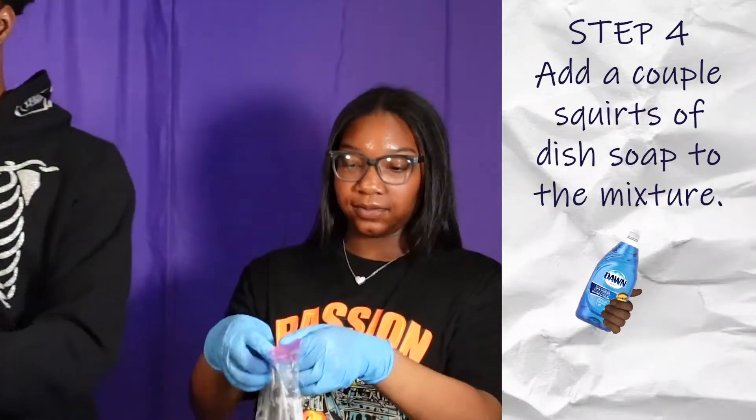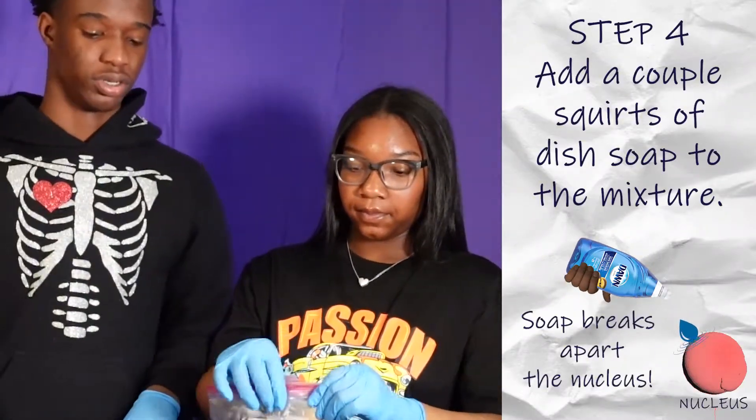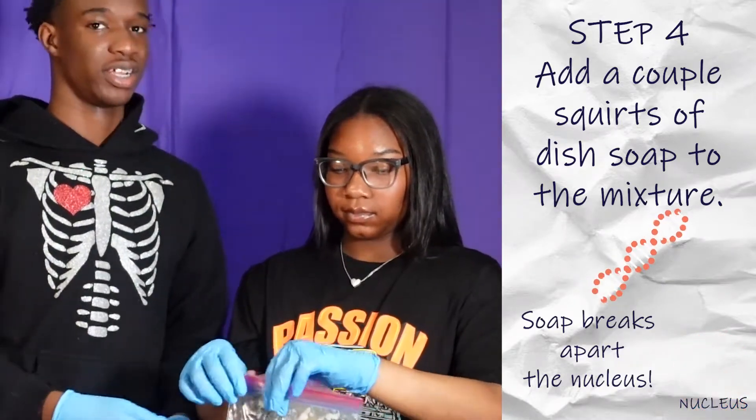Now we pour in the soap to break open the nucleus so we can get the banana's DNA out.